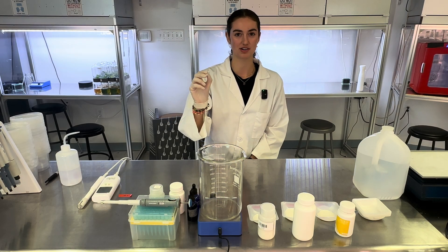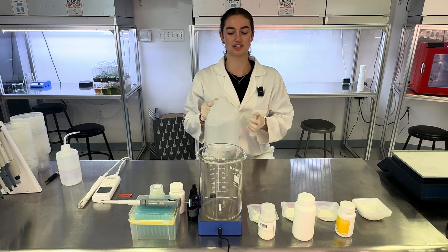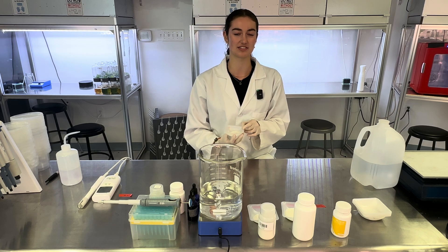Our first step is to add our stir bar to our magnetic stirrer, and then I'll add 800 milliliters of distilled water. Then I'll add 4.54 grams of MS Media from Plant Cell Technology.